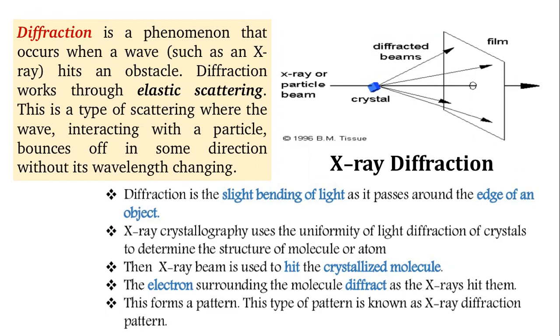And when it falls on a film, it will give you specific patterns which we call the X-ray diffraction pattern. Using this pattern, crystallographers can identify the three-dimensional structure of molecules, how the atoms are arranged within a molecule, which ultimately helps us determine the 3D structure of the molecule or crystal.